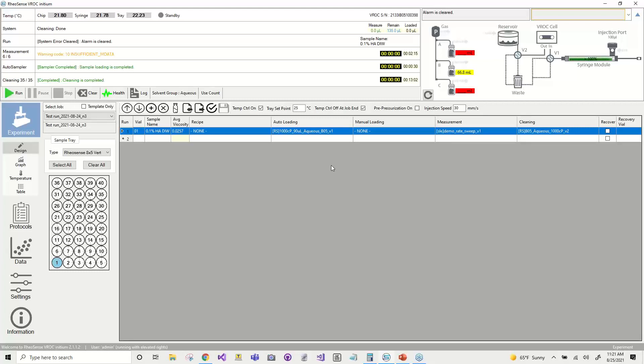The next thing is to select appropriate protocols for your testing. On my screen here you can see we have a few different protocols. The first one you'll need to select is a loading protocol — that tells the system how to clean the syringe and also load the sample, specifying the speed and so on. The next protocol you'll need to select is the measurement protocol. This is where you'll define all the parameters during your testing: you can vary temperature, you can vary shear rate, and you can set up sample retrieval.